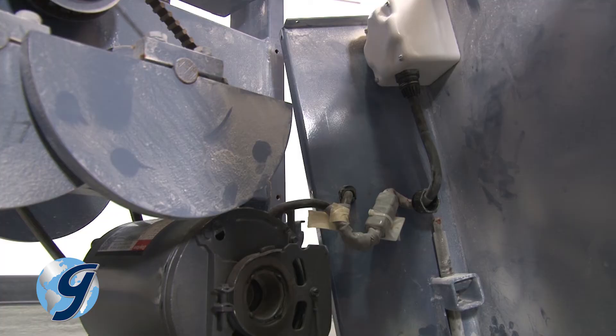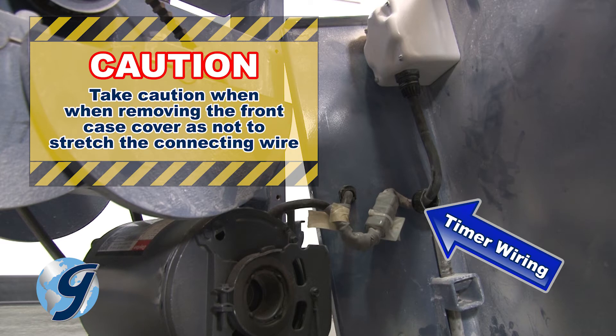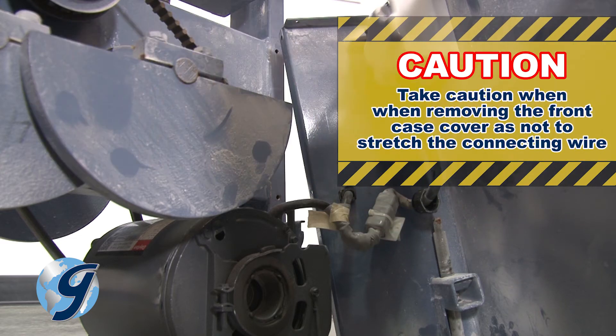Also note that the digital timer is attached to the front case cover. Take caution when removing the front case cover so as not to stretch the connecting wire between the timer and the unit.